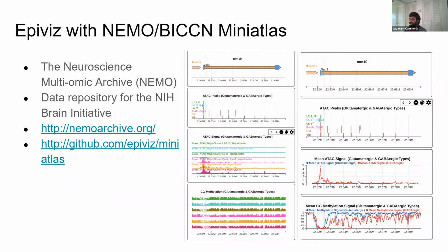And these are not pre-calculated files. These are something that happens when the browser is initialized and when you look at the data within this region. And we generate a couple of workspaces for this.